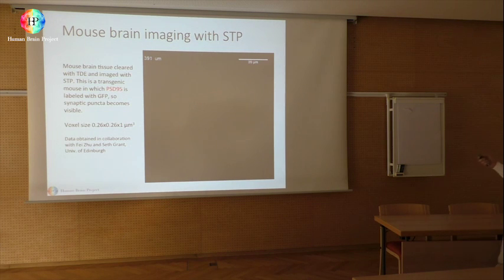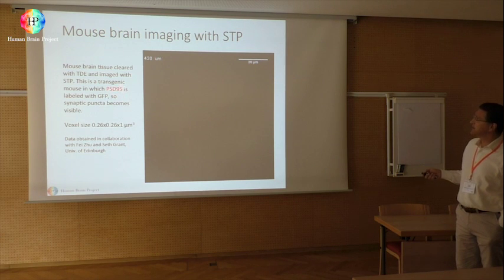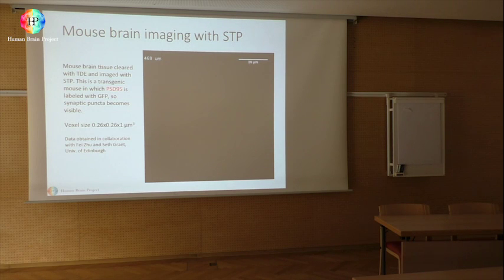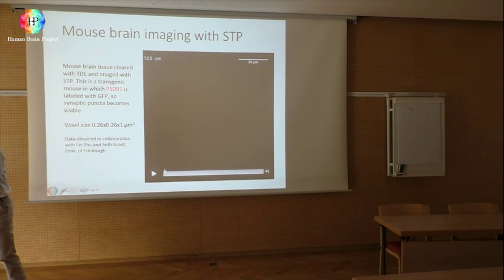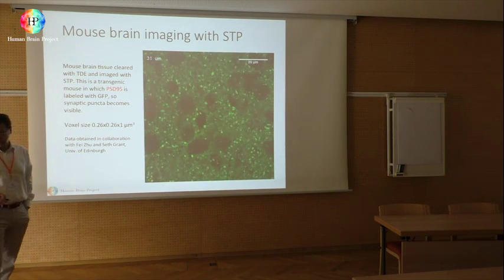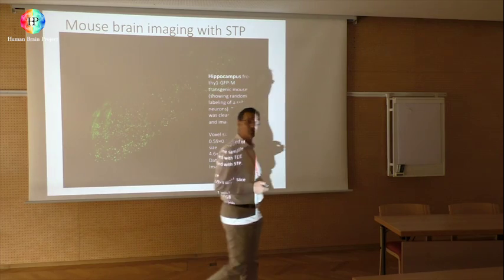So now, what you can see here, in this case, is PSD-95, postsynaptic density 95. What it's doing here, it's creating a scaffolding for the other receptor proteins, okay? And it is, at that point, of pretty much importance in establishing, let me show you again the movie, in establishing, let's say, a certain distribution in the brain. Or you can image the entire hippocampus, for example.